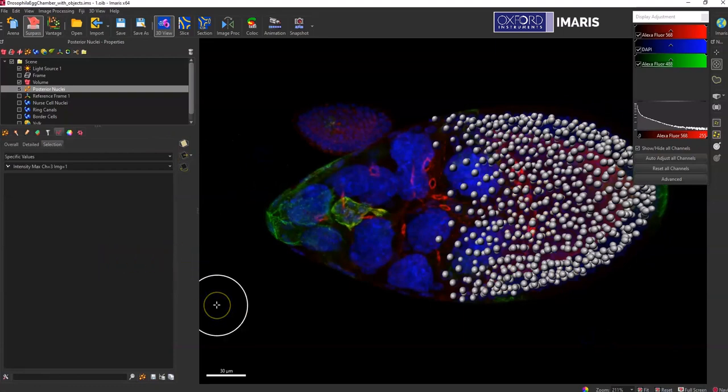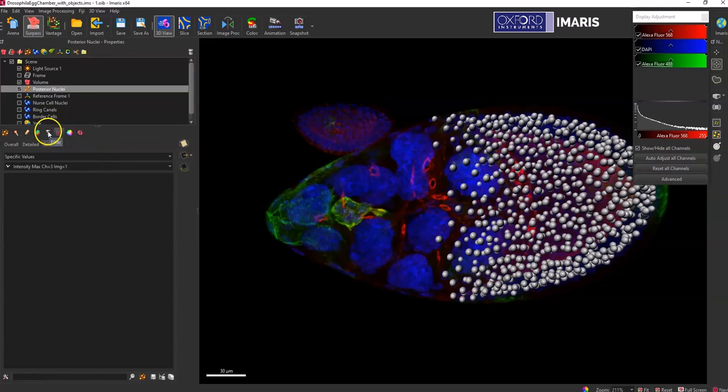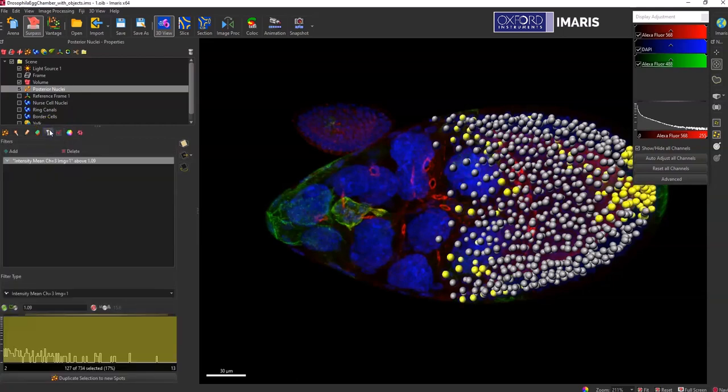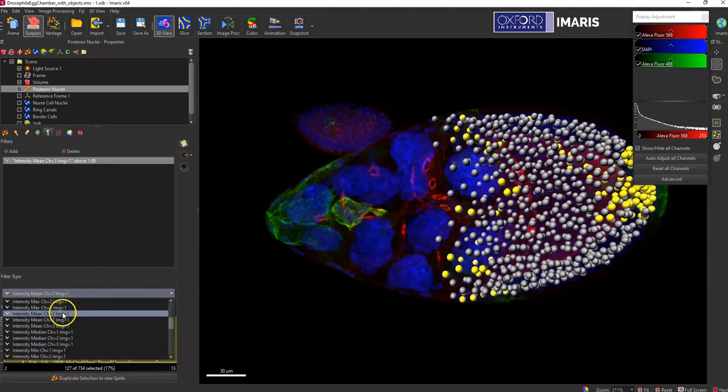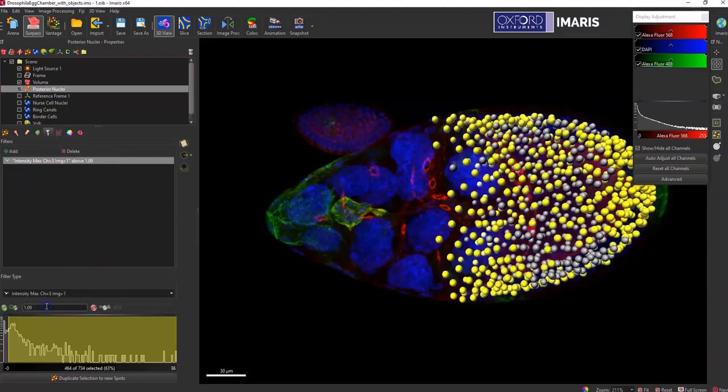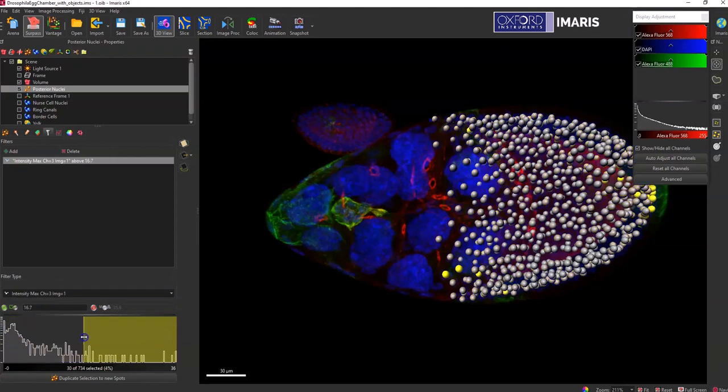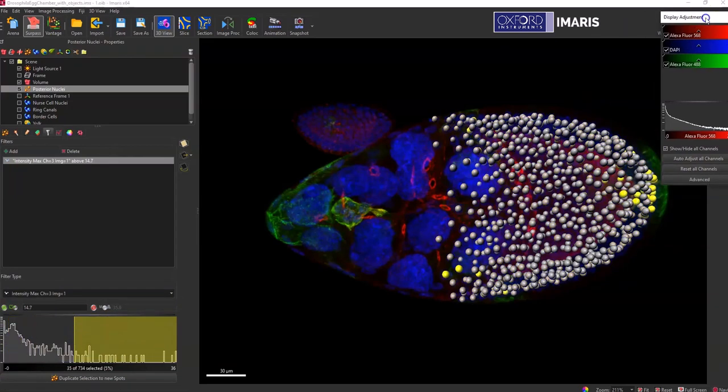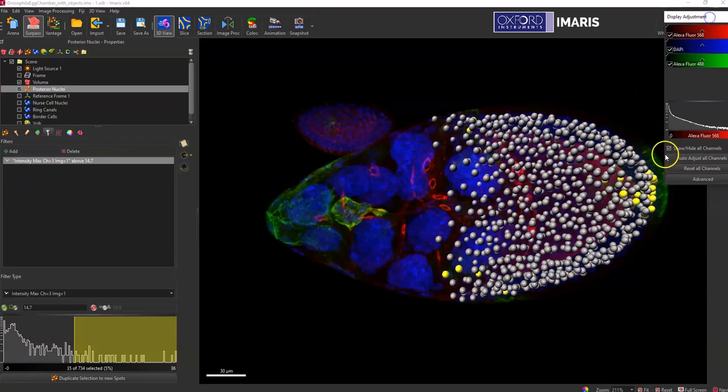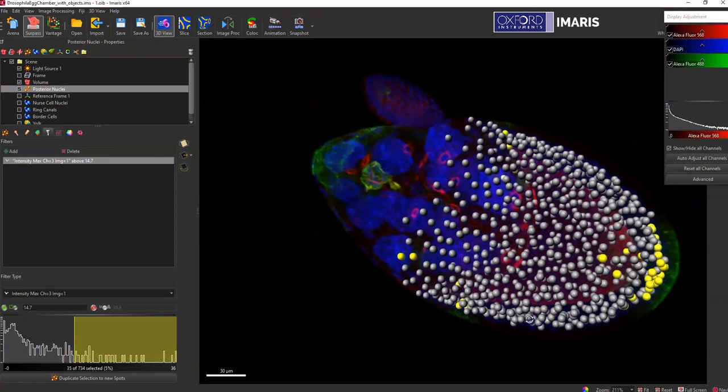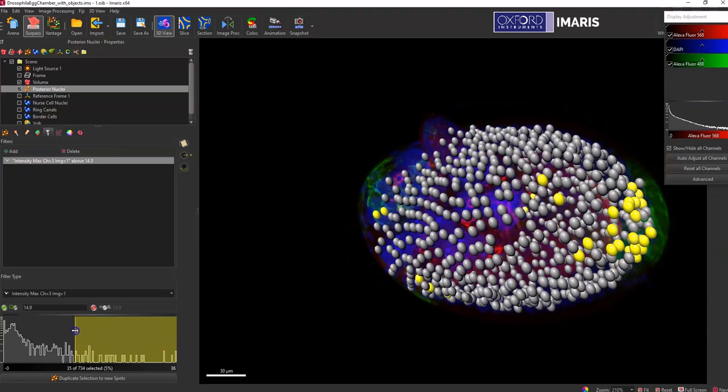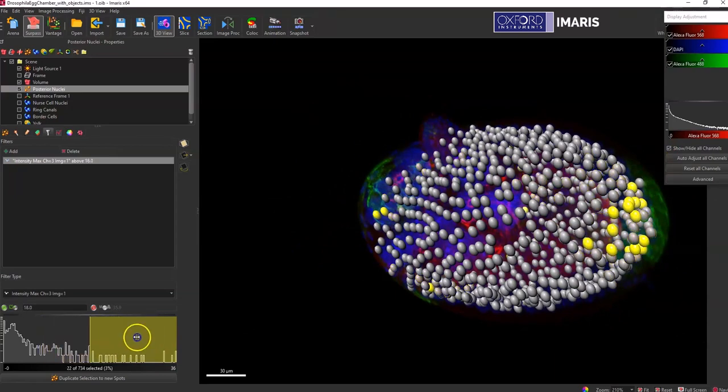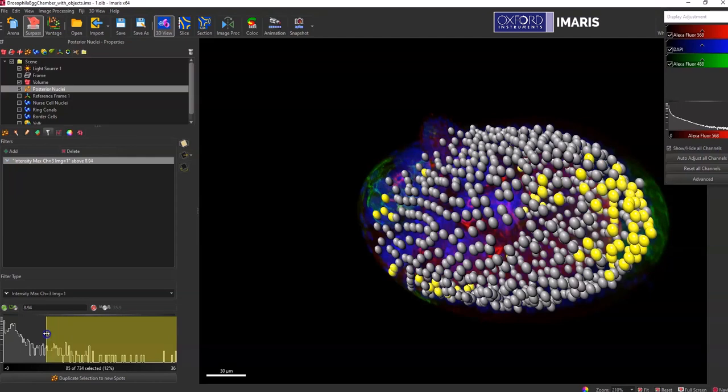Another way to make a subpopulation for exporting statistics is to go to this filter tab. And in the filter tab, this allows you to select your objects based on a statistic. So if I wanted to look at the intensity max, that same statistic I'm looking at for channel three, but then just select ones that are within a range that I'm interested in. You can see that these objects over here have a higher level of the green channel, and so I'm selecting based on the statistic. This is my selection, once again, highlighted in yellow.